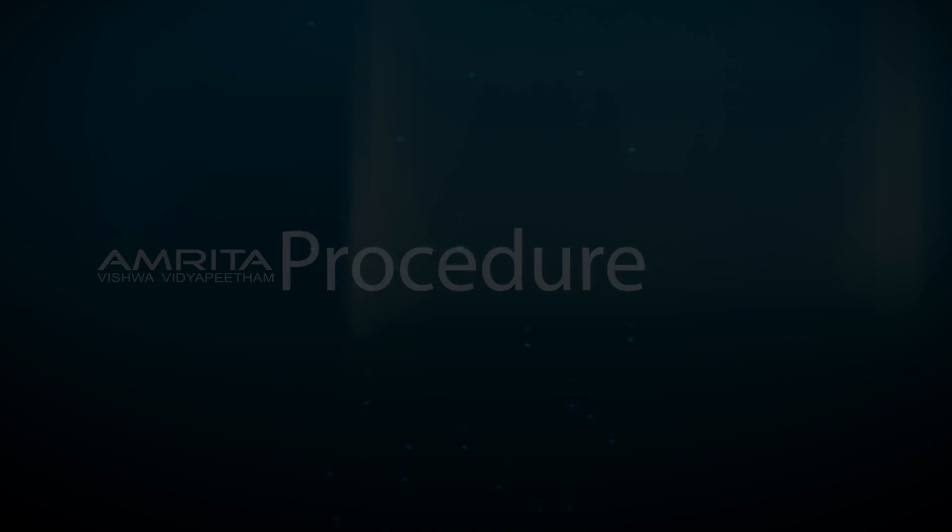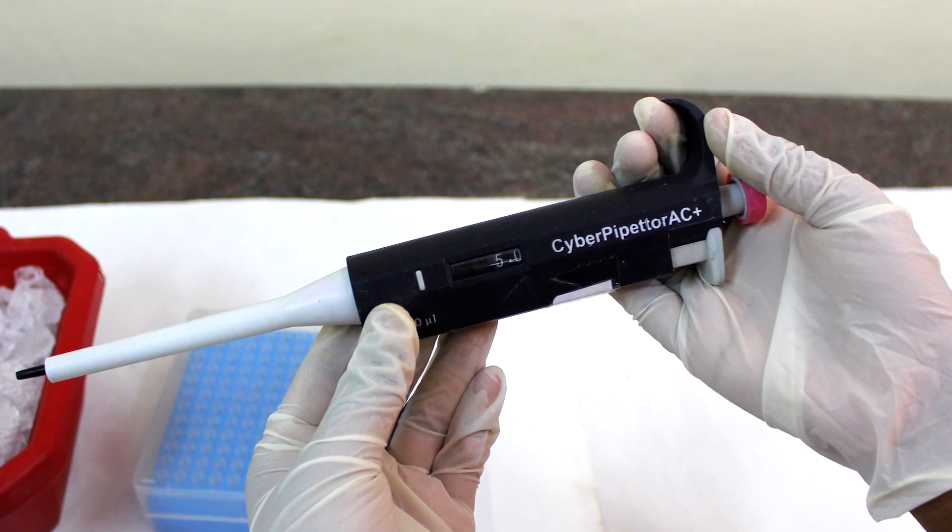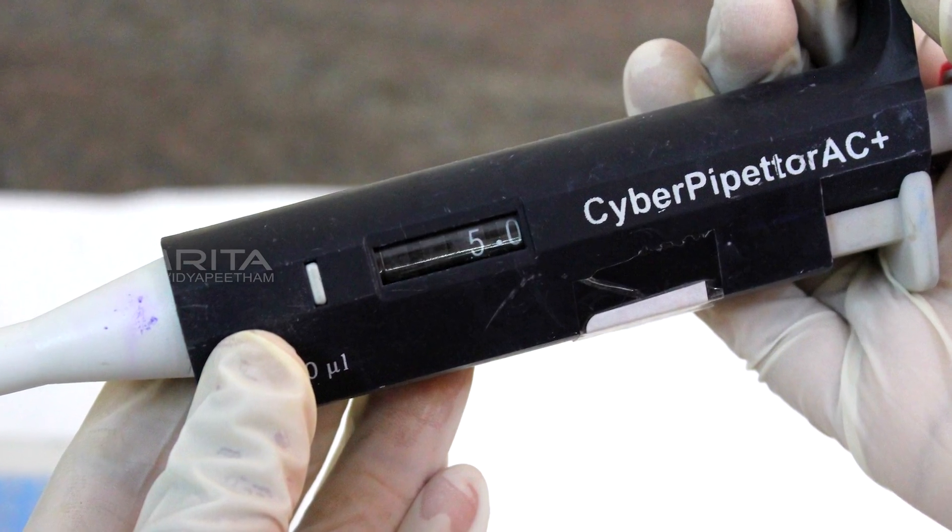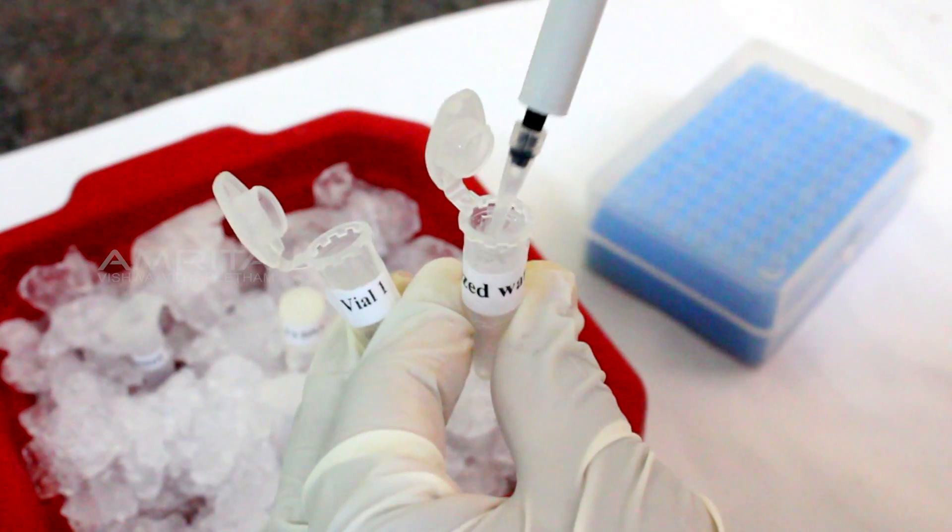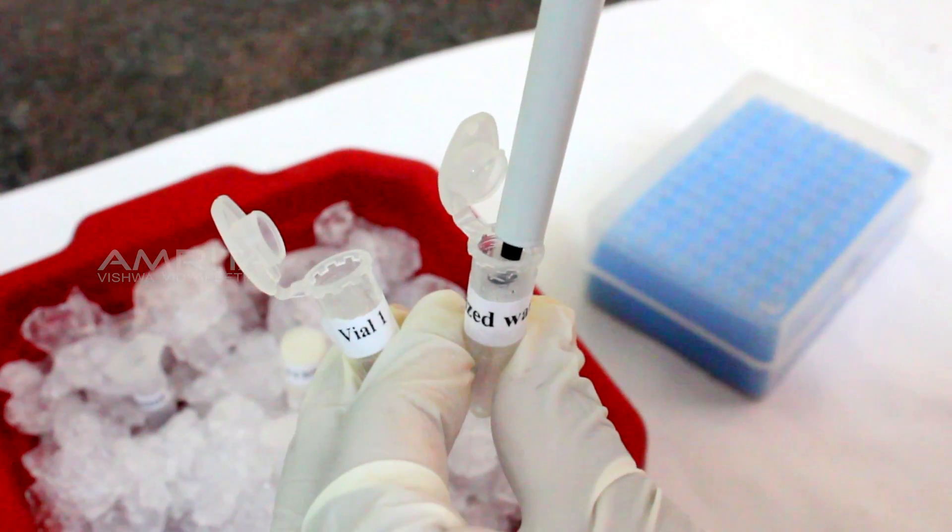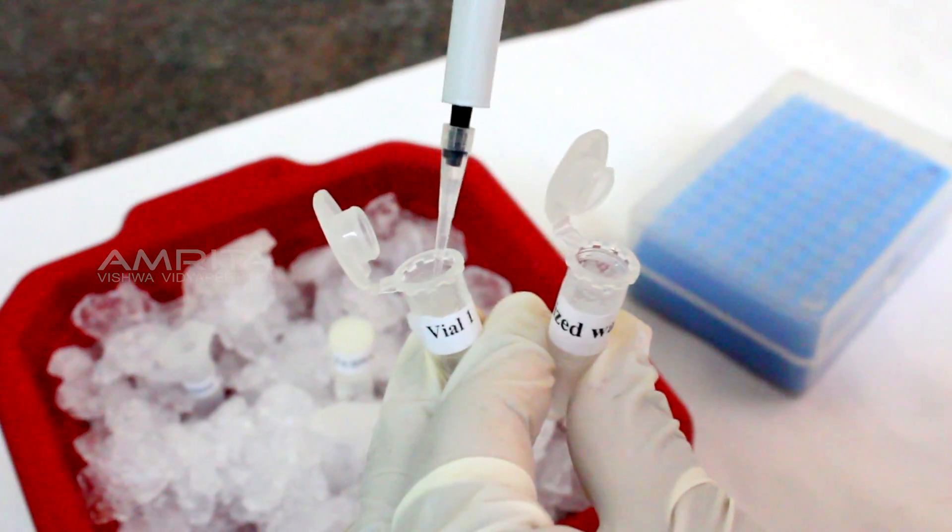Procedure: Take a 10 microlitre micropipette and adjust to 5 microlitre. Insert a fresh micropipette tip into it and transfer 5 microlitre of deionized water to an empty vial labeled vial 1.